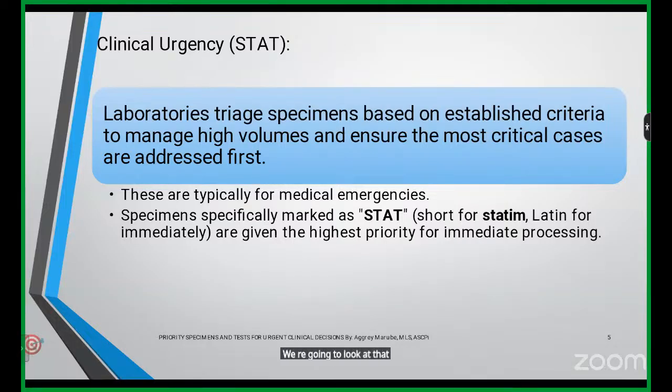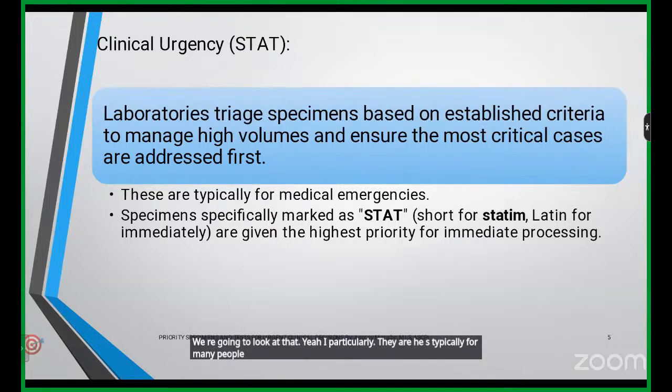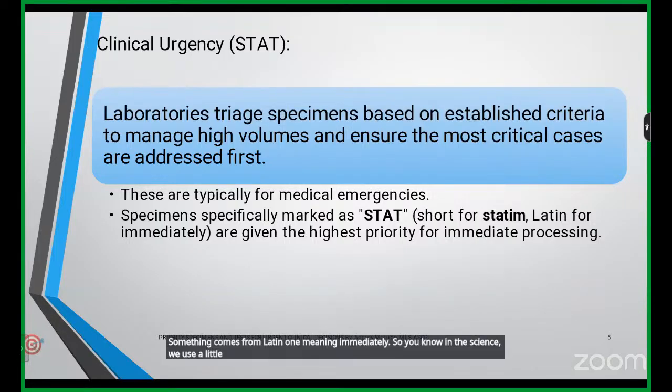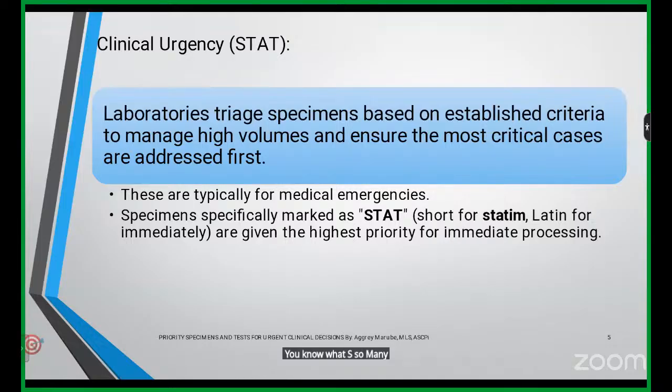These are typically for medical emergencies. Specimens specifically marked as stats, or short form statim. Statim comes from a Latin word meaning immediately. So in science we use a lot of Latin words. There are so many, and these have been brought into the English language courtesy of the scientific world.